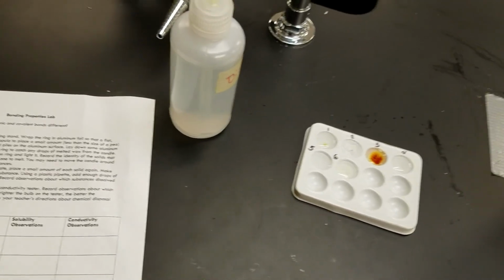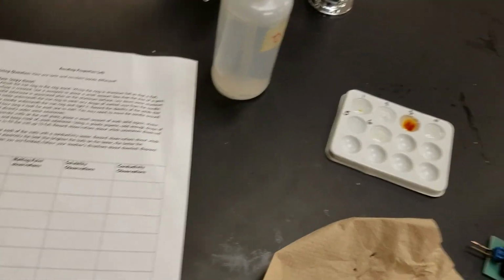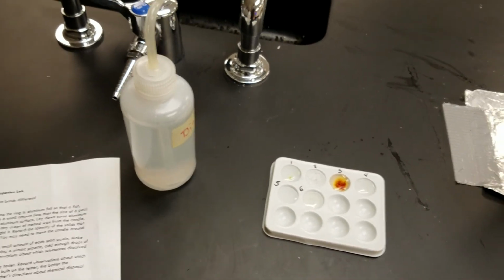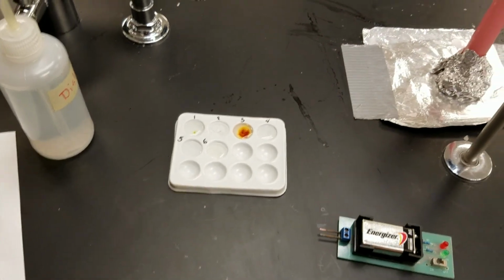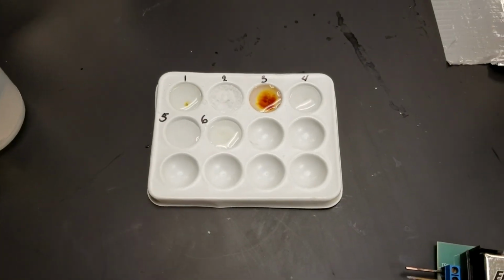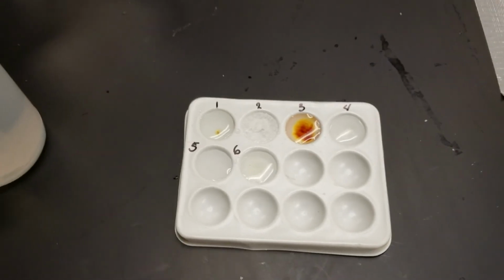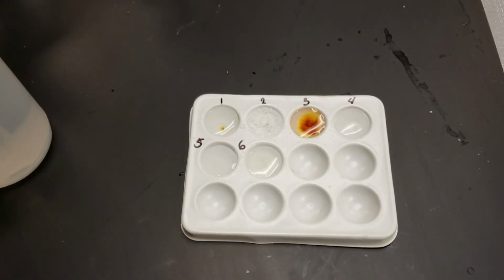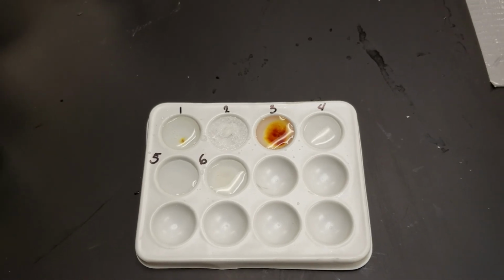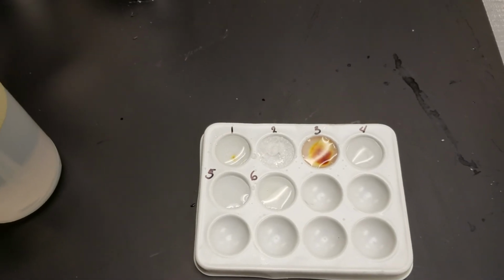I would expect that some of these would have no conductivity, but that doesn't appear to be the case for what I've tested. There could be errors, there could be something mixed in with any of these chemicals that caused it to not do what I expected to, or maybe I was just wrong. It's up to you to decide.